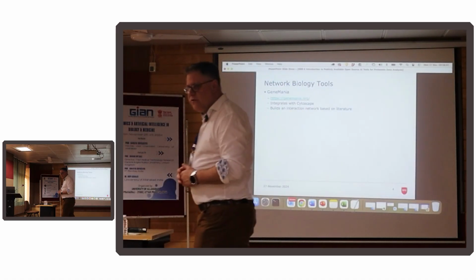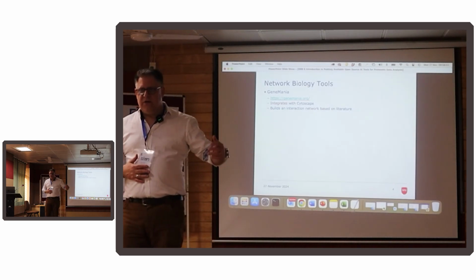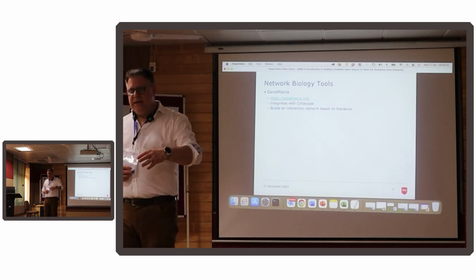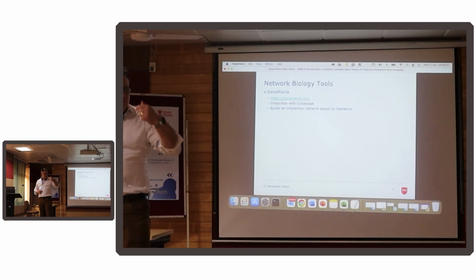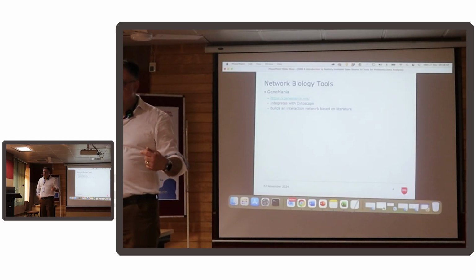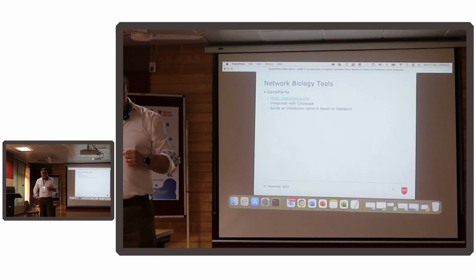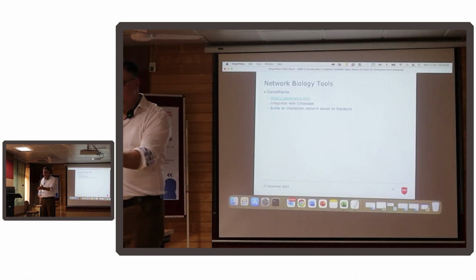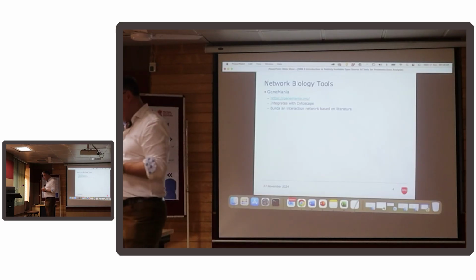You could build a classifier in Weka using AutoWeka, or you could use parameter selection and find what was the best subset of those DEGs in combination that predicted the class. So you can see immediately there's a lot of ways of using this to explore your data further.